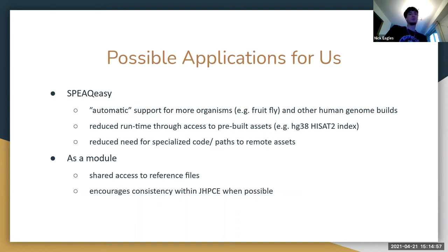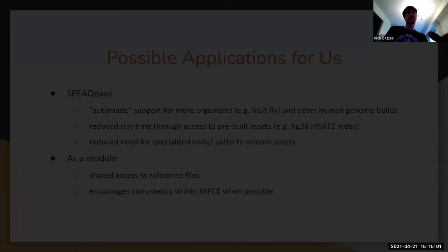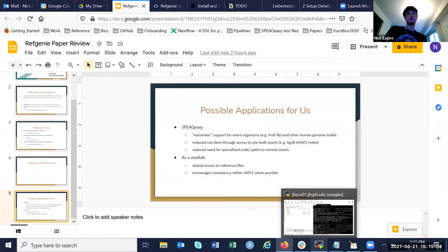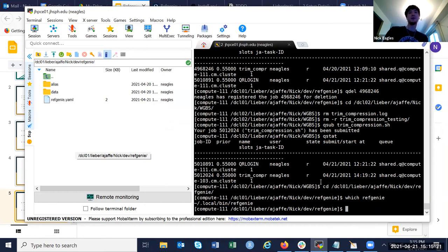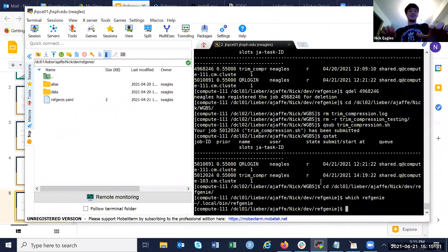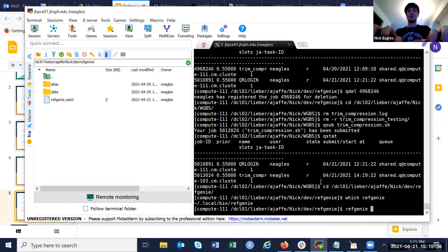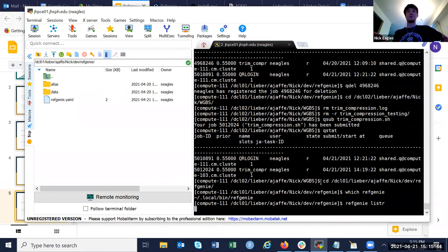I thought I would go into the actual code to show what it looks like. I got it set up here — I had to add something to my path and set a configuration variable. One of the commands is showing what files are available on the default server — that's 'refgenie listr.' So we get a list of what they call aliases, the name of the genome.